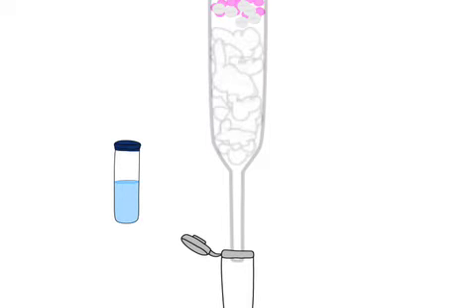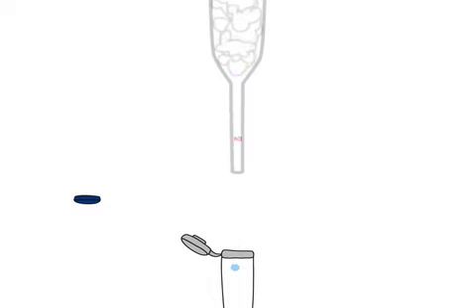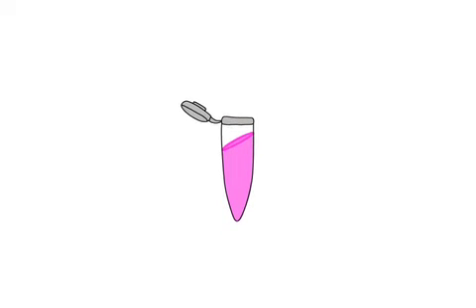Elution buffer, which contains imidazole, will help isolate the fluorescent proteins directly. The imidazole from the elution buffer will connect to the nickel beads and in turn replace the fluorescent proteins so that the fluorescent proteins will fall into the microtube. Now the fluorescent proteins are fully isolated.